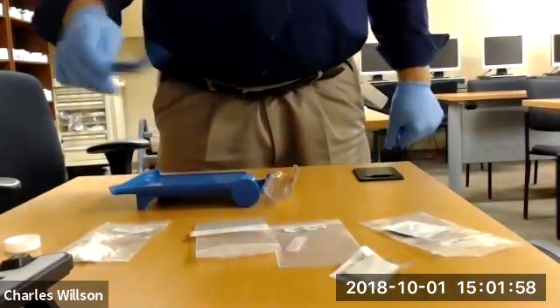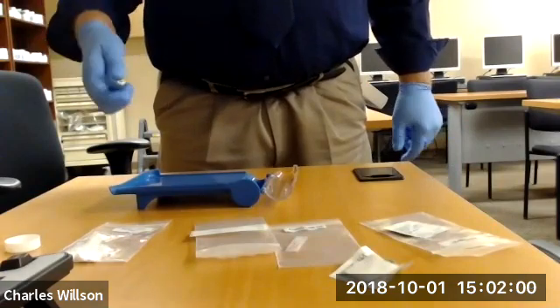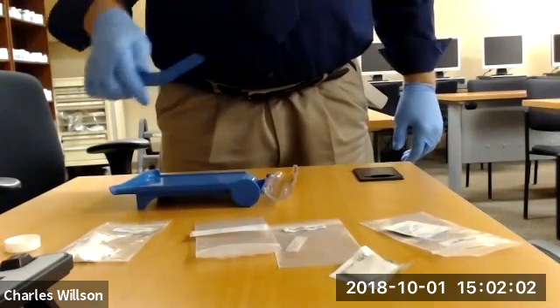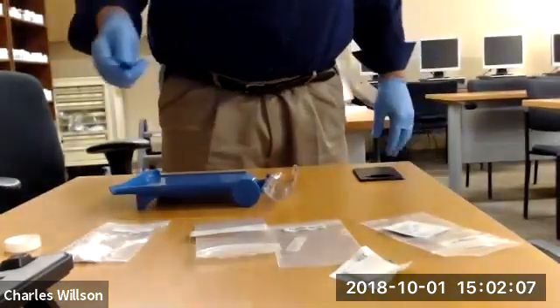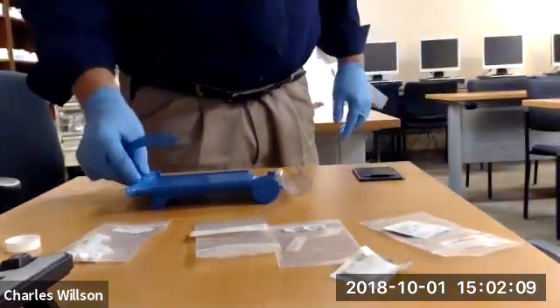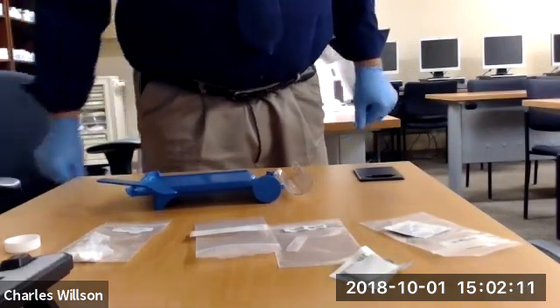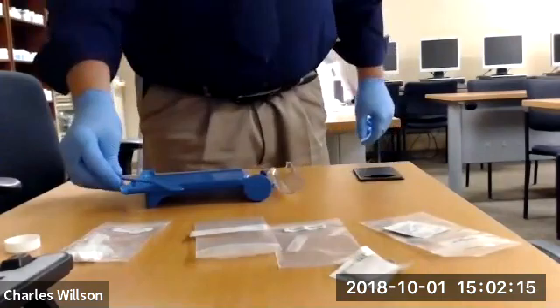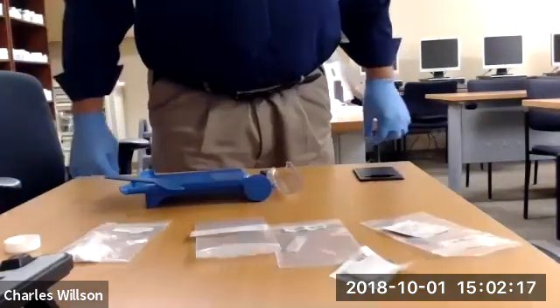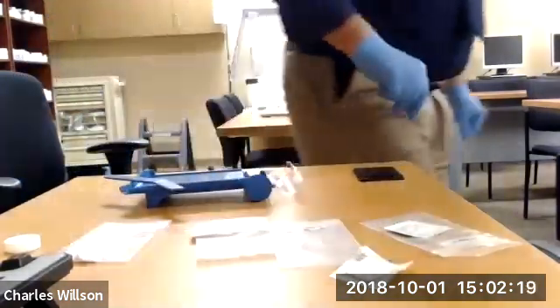dust gets in there and somebody could be allergic to a medicine that they're not actually taking, but they could get some from the dust from a previous prescription. And so you want to be a little bit careful about that. And you do want to clean your counting tray and spatula fairly regularly. Okay, so there we have it. We've cleaned it.